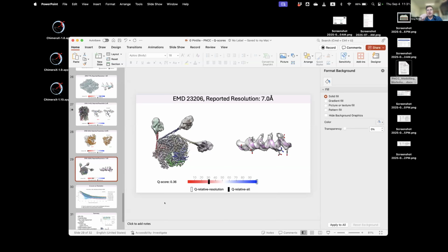and this was also something that came up with the earlier versions of the Chimera plugin, where initially we used a sigma of 0.6, but when EMDB started to integrate them, they used the sigma of 0.4, which allows us to compare maps and models at up to 1 angstrom resolution. So that's likely the right reason. I'll have to double check in the ChimeraX plugin what sigma is being used, and I think it's adjustable.